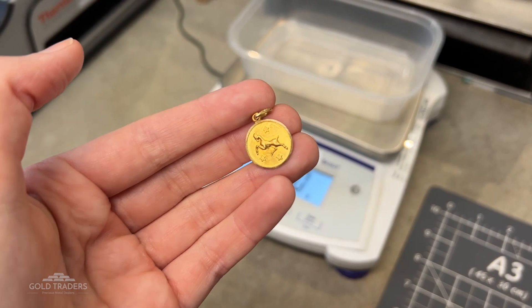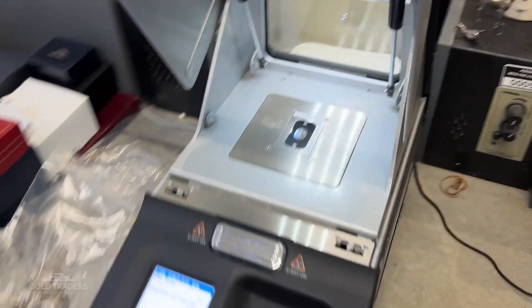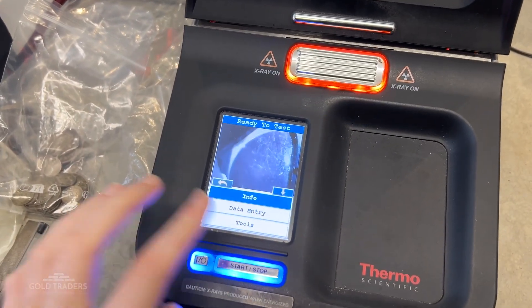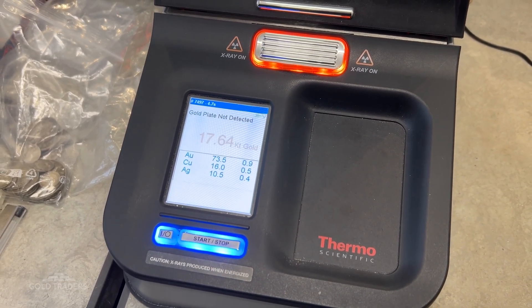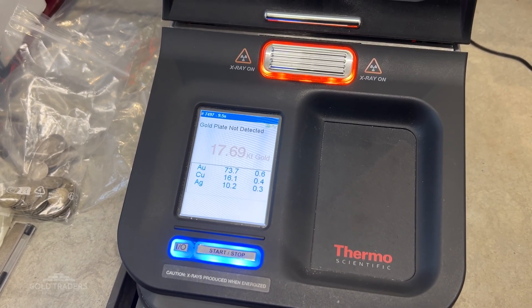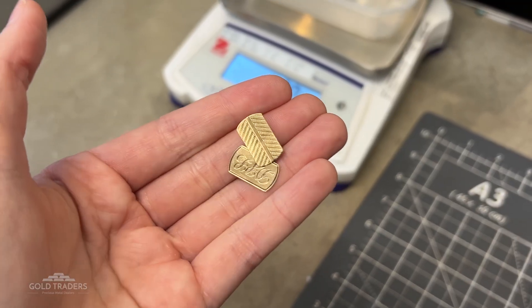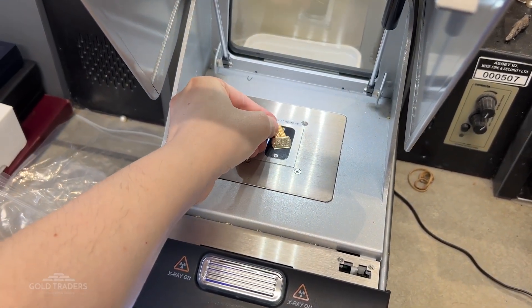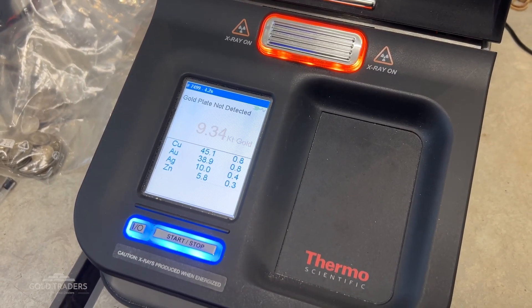It is a similar story for this little charm here. On the back of this charm there is a 750 hallmark which would say that it is 18 carat. However, sometimes in the alloying process it does end up being a little bit below. This is completely normal, and as long as your gold has received a hallmark to say it is 9, 18, or 22 carat for example, you will still get the full carat price for your gold. Our final item is this pair of cufflinks, which actually has the opposite problem where the gold carat is slightly higher. This particular alloy also introduces a metal we haven't seen yet, which is zinc.